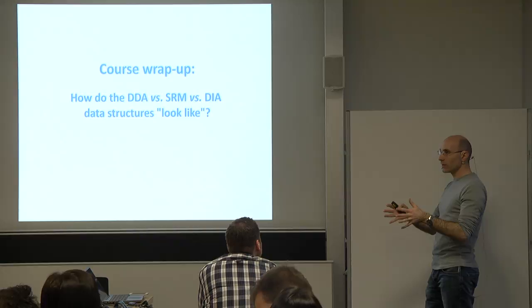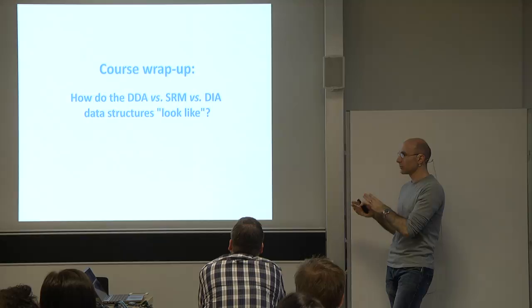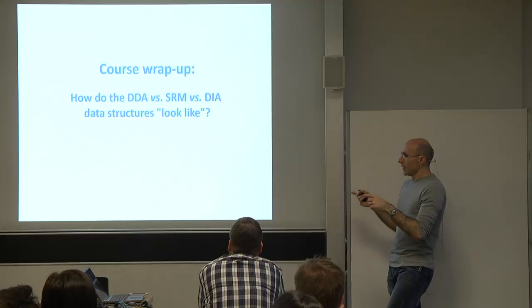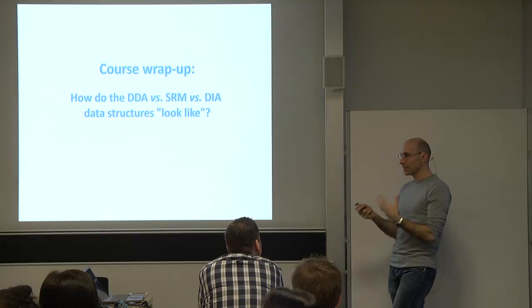And in the next couple of slides, I will introduce you to this concept I told you about, retargeted proteomics. I think Ben already showed you most of these slides. These are slides I prepared for a review that's going to be published in June. And I'm going to explain, from these data structures of SRM, DIA, and DDA, how you can basically extract the data or query the data in different manners, okay?